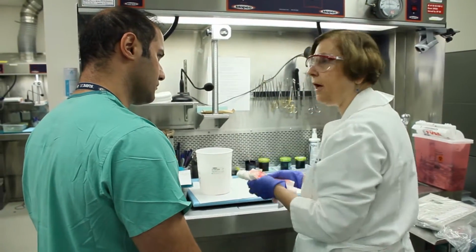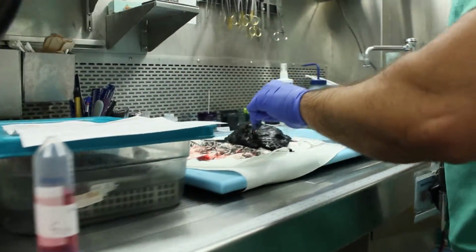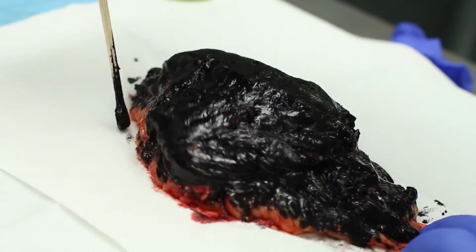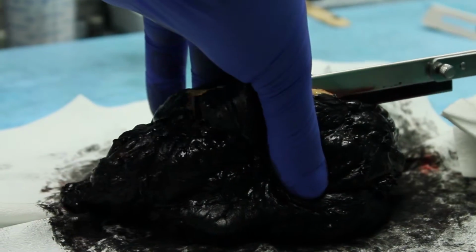So the surgeon removes the organ of interest. It is immediately transported to the pathology department. It's received, and as I said, examined by a pathologist and or perhaps a resident. First step is to put ink over the outside of the specimen because that marks where the surgeon cut. And we then can open up that specimen and look at it.